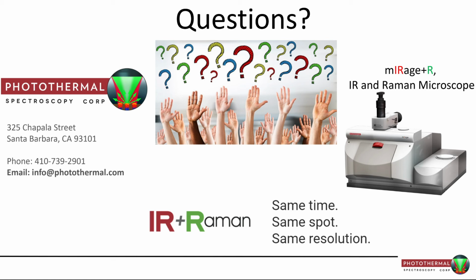The next question, Victoria, I'm going to throw your way. Similar to the other question really, does a sample need to have a flat surface in order to be analyzed by O-PTIR? Well, from our experience, we saw that, of course, the sample should be a bit flat to have some signal, but it doesn't need to be totally flat, like for other techniques such as ATR.